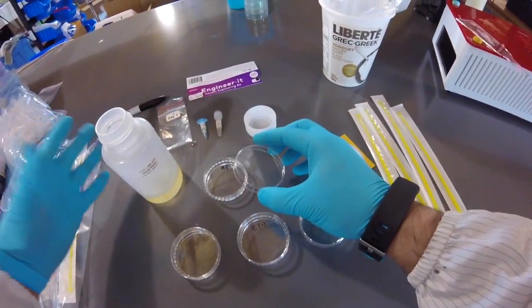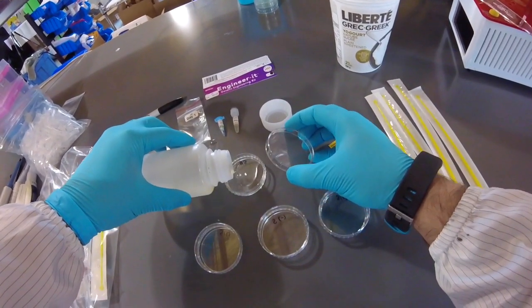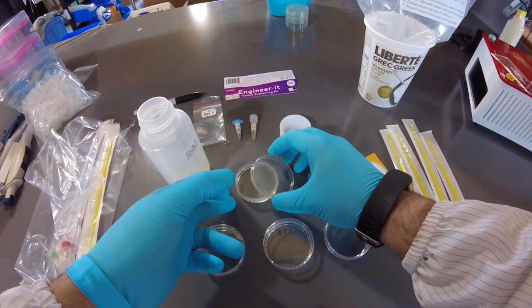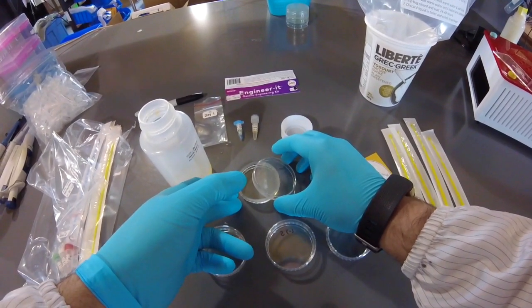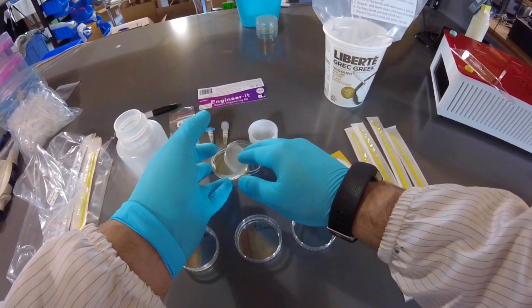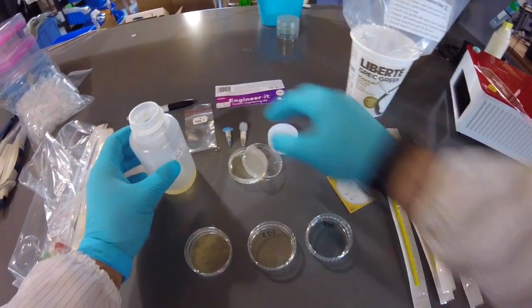Okay, so again, it's a little bit hot, so just be careful. I'm going to pour this so that it's halfway, pretty much up to the star. Okay, and I'm just going to set the lid partially over, and this will help it cool faster, and help for a little bit of evaporation so it doesn't get super humid inside the plate.